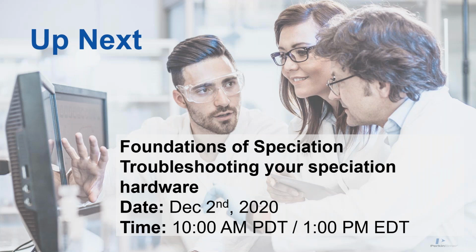Yeah, that's right. If you're getting the right number in whatever matrix you're running, you shouldn't need to do a correction. But you should visually look at your spectra to verify. You can usually see if there's an issue, and if your spike recovery is also coming in where it should be, in the appropriate range, then you don't need to do a correction. Correction is really only to correct, as Brady kind of said. Don't do unnecessary corrections if you don't have to.